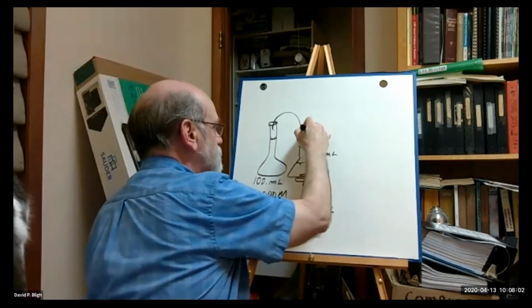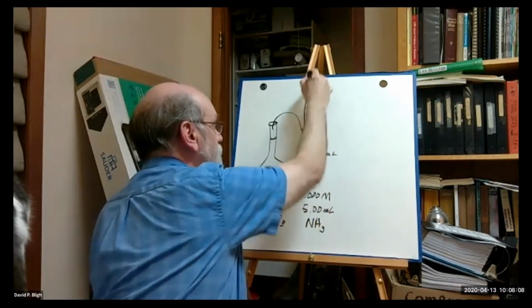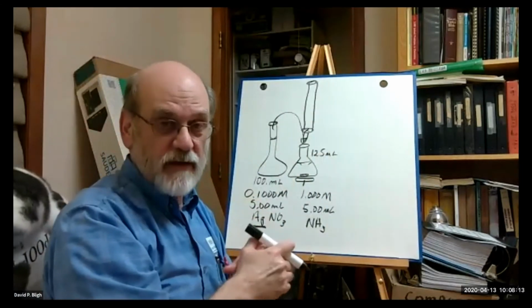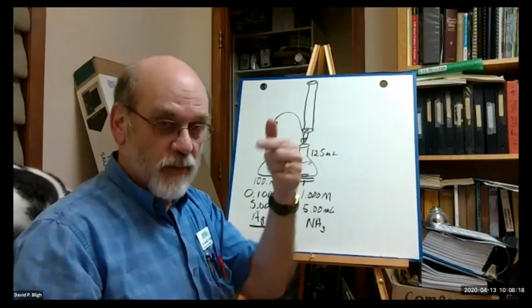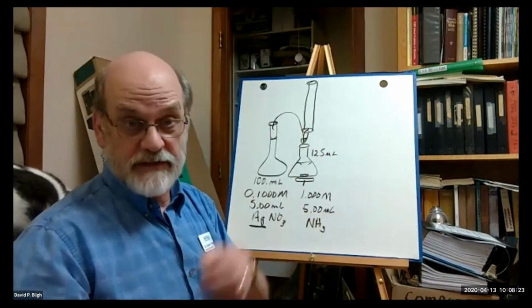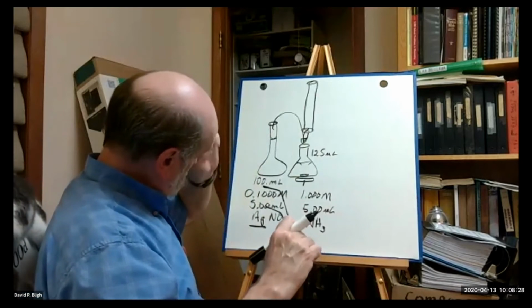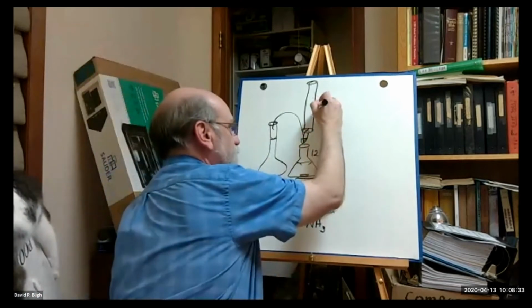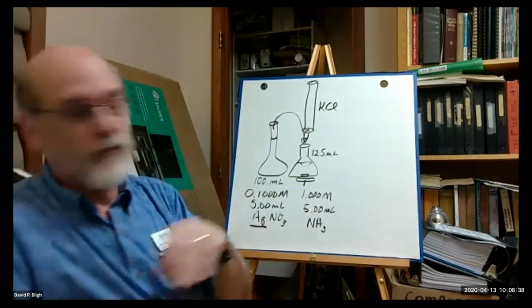The valve. Right? You know how burettes work. Right? You can read them down. They're calibrated for tenths of a mil, but you can interpolate between the marks to get some fraction of a tenth of a mil in the hundredths. Right? So we add our potassium chloride, and the potassium chloride is what concentration? It's 0.1 molar.